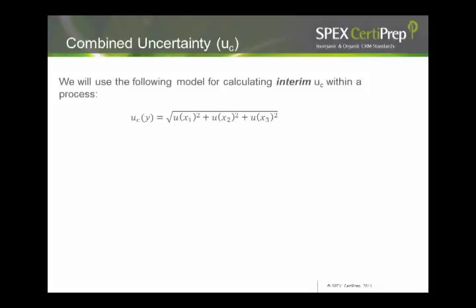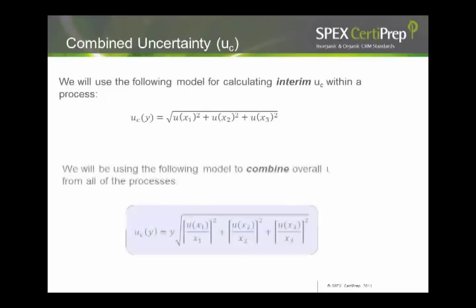There are 3 types of type B uncertainties. They are rectangular, triangular, and normal. To calculate the standard uncertainty from this listed uncertainty, we have to apply a normalizing factor for each of these. We will review these factors for each type.